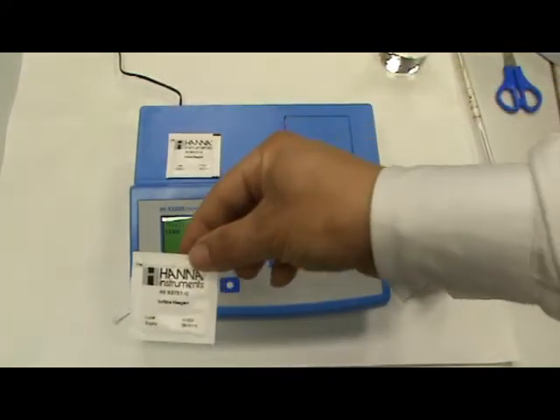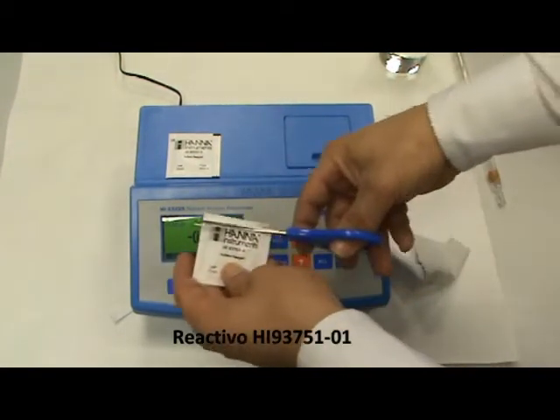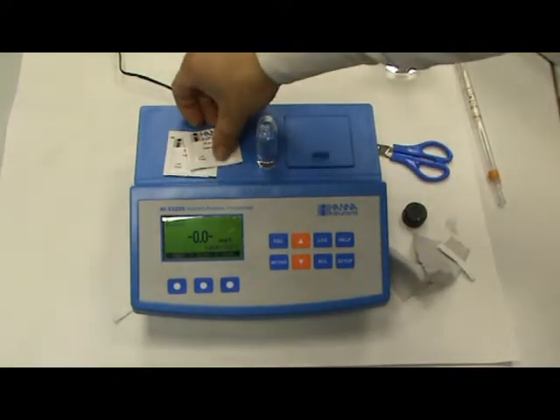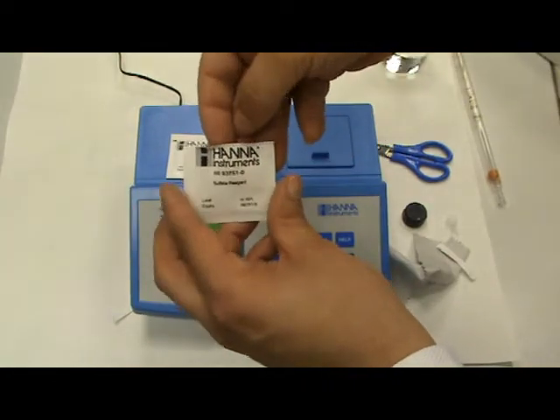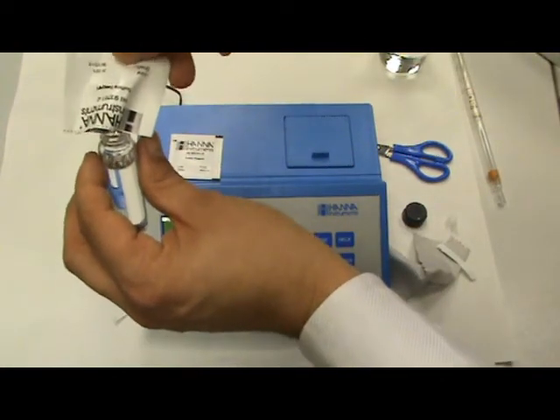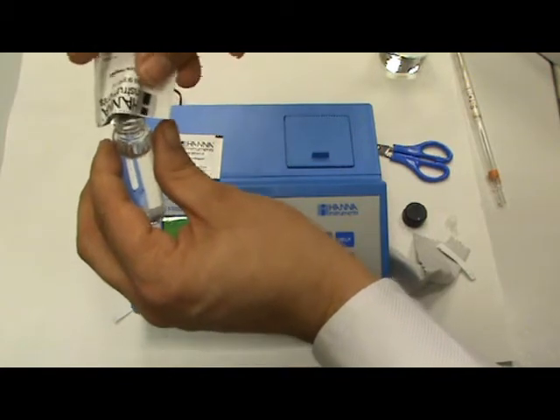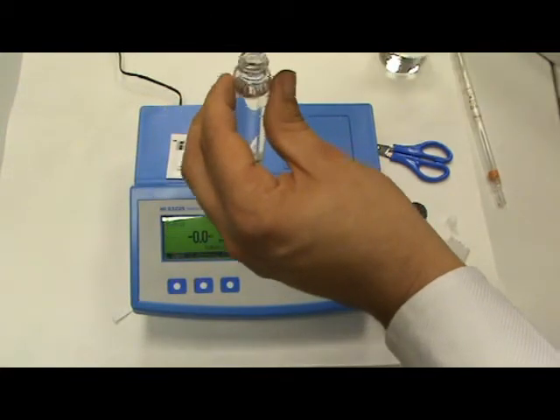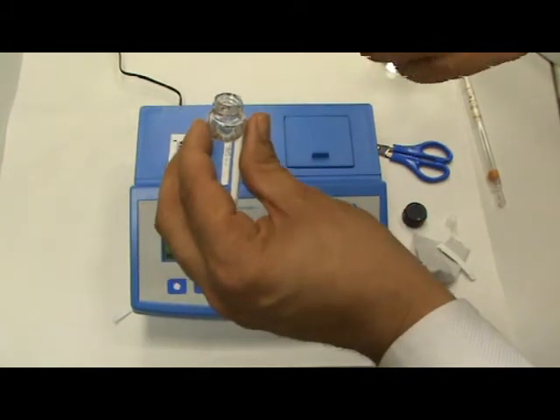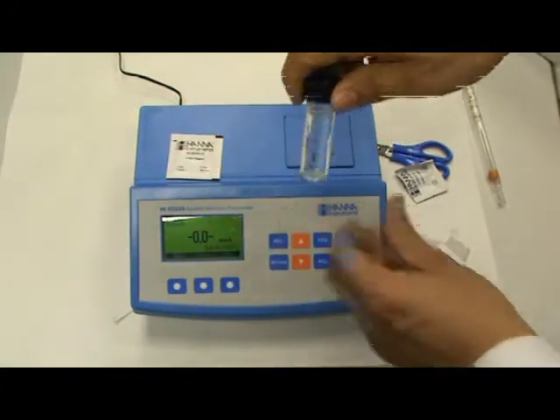Ahora se calibrará y le añadiremos este reactivo. Ya está calibrado. Y ahora le vamos a añadir este reactivo. Una vez quitado el tapón y el obturador, le vamos a añadir el reactivo 93751. Hacemos una pequeña acanaladura para que caiga bien el reactivo y lo vamos dosificando. El reactivo va en exceso, por lo que no pasa nada si algo se vierte fuera. Volvemos a tapar y limpiamos un poquito.